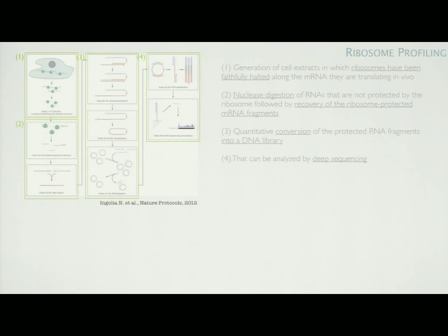And we use ribosome profiling. And what is ribosome profiling? Well, ribosome profiling, it's a protocol that really captures the small stretches of mRNA which are within the ribosomes while they are translating. So in a way, you more or less have a snapshot of what's going on translation-wise. So you actually measure proteomics, but on the mRNA level. And this information we use to come up with custom databases.